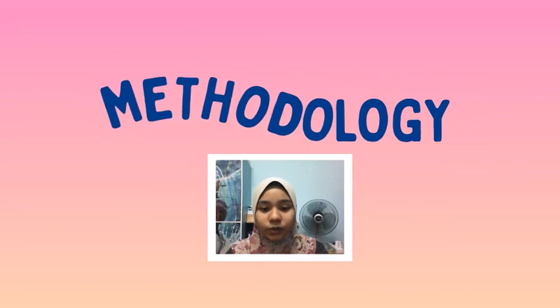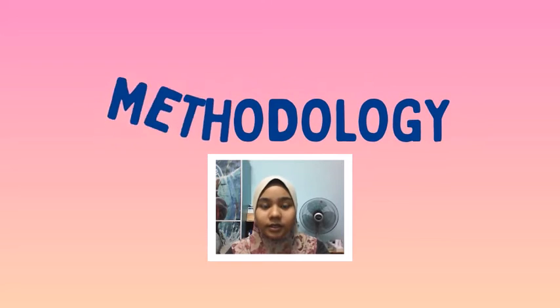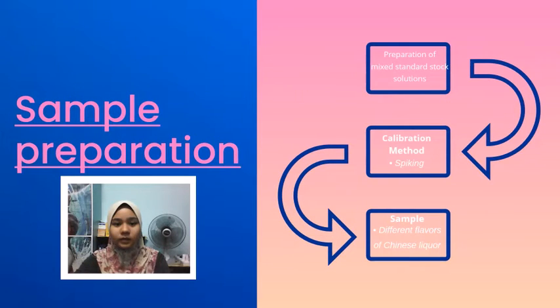Hello, my name is Nur Ananajiha binti Kamal Zaman, and now I will be presenting the methodology. For the sample preparation, firstly, mixed standard stock solutions will be prepared by adding defined amounts of each single standard compound with a microliter syringe. A stock solution of 10 compounds, each with a concentration of 1000 micrograms per ml, was prepared in a 60 ethanol to 40 water solution ratio.